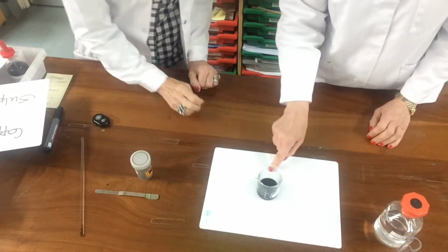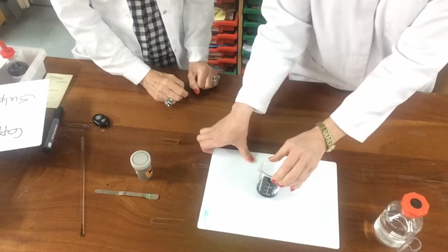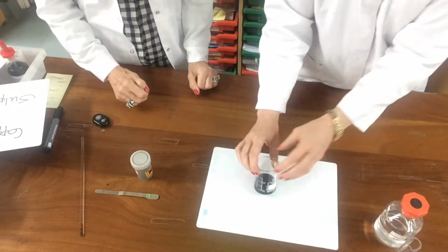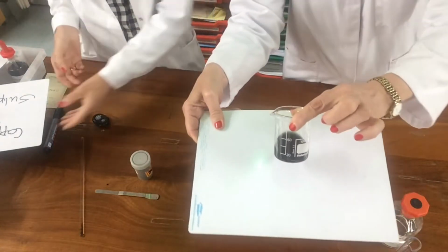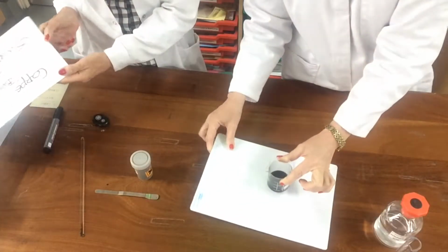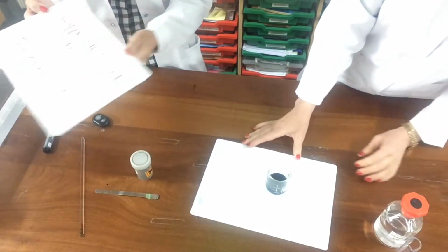Now I put this onto a white background so that we hope once the solid has settled, you'll be able to see the colour of the products that are formed. We'd have to wait for that to settle a little bit. I don't know if you're going to be able to see it very well. While we're waiting for that reaction to occur, then we'll just discuss the word equation.